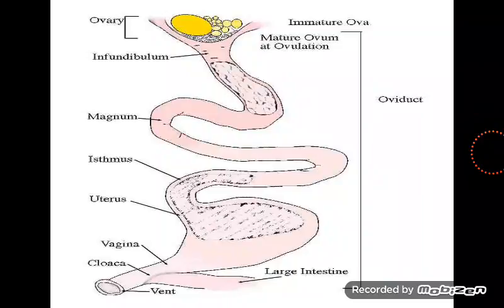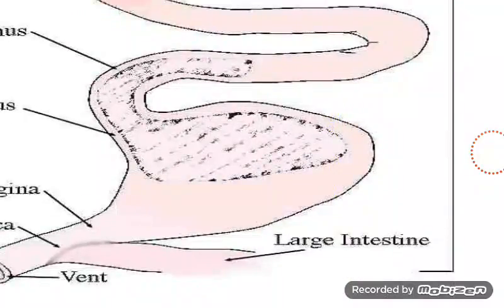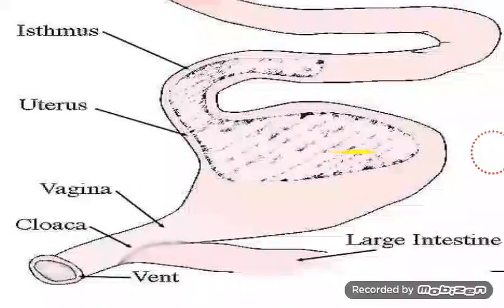All right. Then you could see here, like I told you, that the reason why chicken doesn't urinate separately is because the kidney is connected to the large intestine, and the reason why the birds do not have different openings for removing feces and laying of eggs, is because here you can see that the large intestine has been connected to the cloaca, and the vagina too is also connected to the cloaca, so everything is through this cloaca.